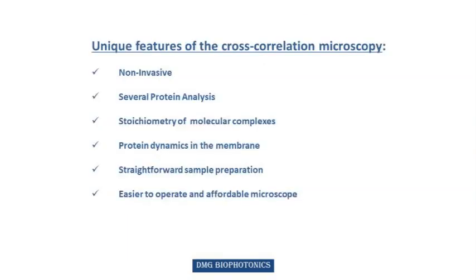In conclusion, this non-invasive method operates under low excitation power and enables cross-correlation analysis of 2 to 4 proteins in living cells from tens of minutes to several hours, provided cellular conditions are properly maintained. It provides quantitative assessment of stoichiometry of non-constitutive complexes and their dynamics.